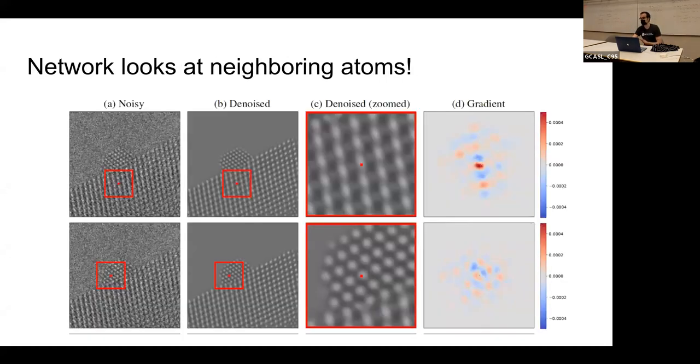Maybe it will be clearer here. So the idea is this. We have the noisy signal and we're interested in a specific pixel, this guy. This is the denoised pixel, and it's computed with this field of view, like doing some kind of function that includes all of this area in this red square. That function is super complicated. It's like half a million parameters or more.